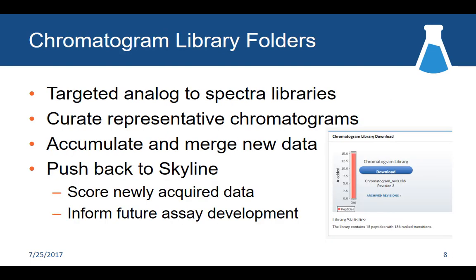And then chromatogram library folders. So like I said, kind of the analog of spectral libraries.